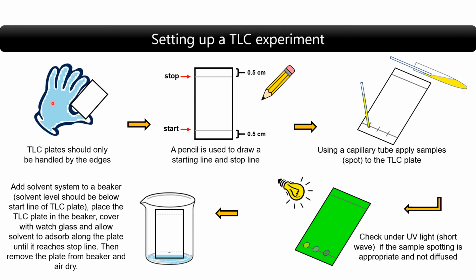We should avoid touching the surface of the TLC plate even if you are wearing gloves, because we have to assume the gloves might have many types of contaminants on it, and if we touch the surface, those contaminants would get absorbed onto the plate and contaminate the plate, and that would interfere with observing a correct result.